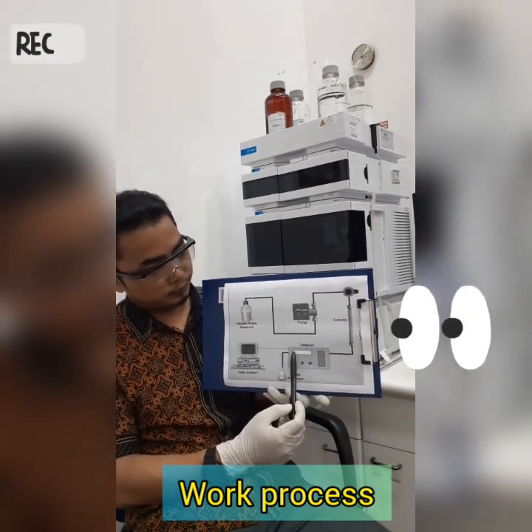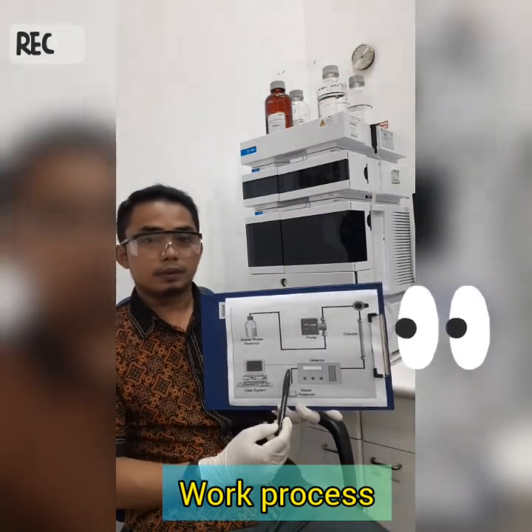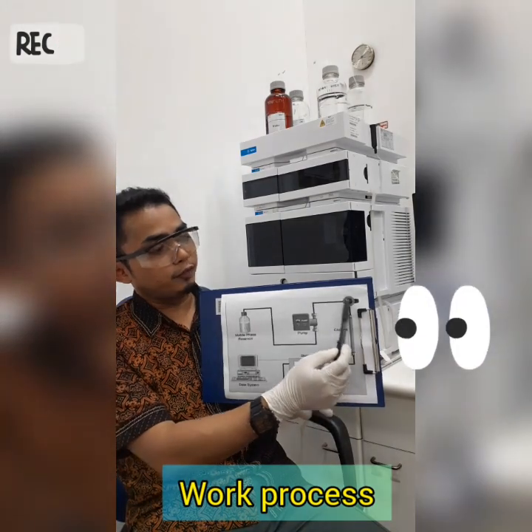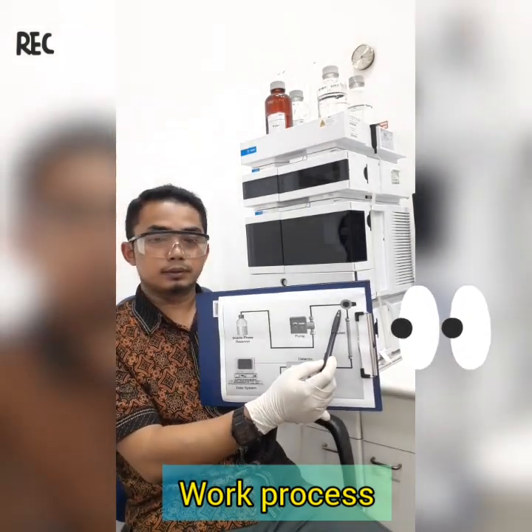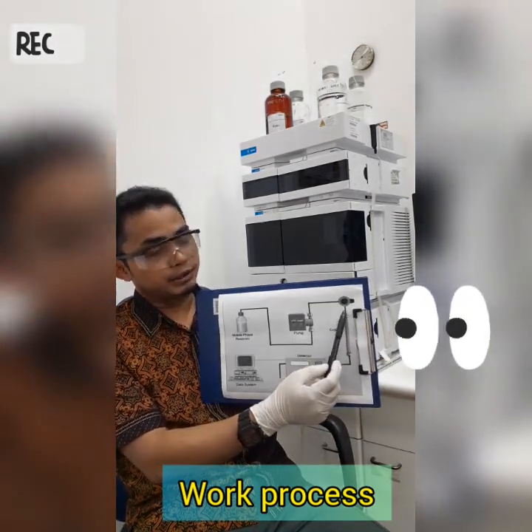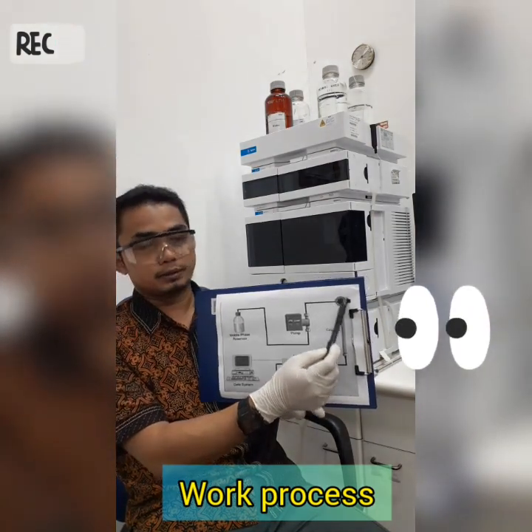The rest of the mobile phase goes to the waste reservoir. The sample is injected through the injector unit, which can be a single injection or an automated injection system or autosampler.